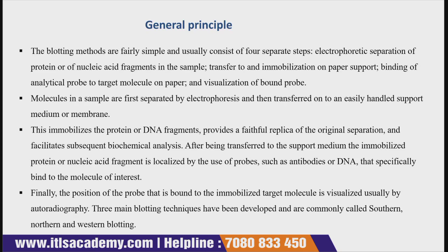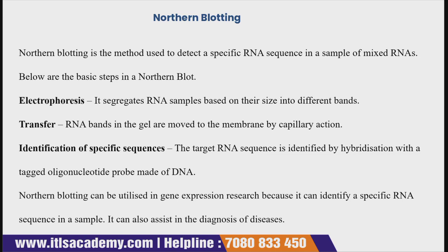Now comes the general principle. So what is the general principle behind this blotting technique?